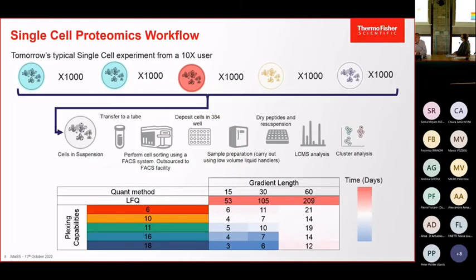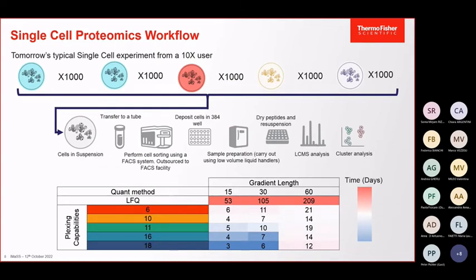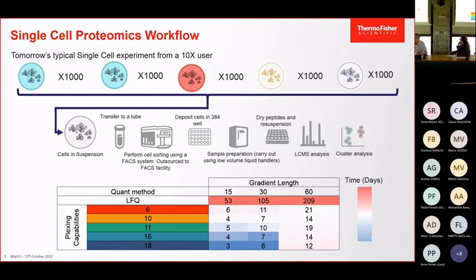So let's look at an experiment that some of you may be doing today, or may be doing in your laboratories tomorrow. This is just a simple view. If we take 5 different sample sets, they may be different time courses, different drug loadings. In order to understand and analyze them, you need to not just run one, you maybe need to run 1,000 different sets from each one. So that's 5,000 analyses you have to do, and a complex workflow to go through.